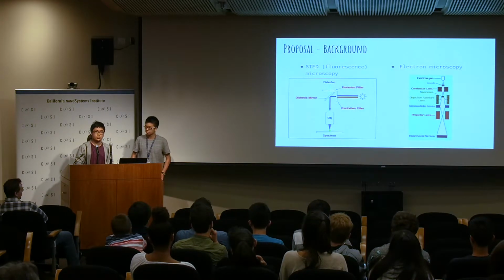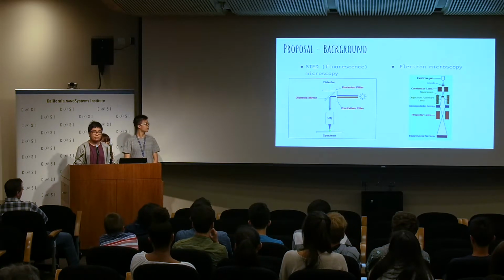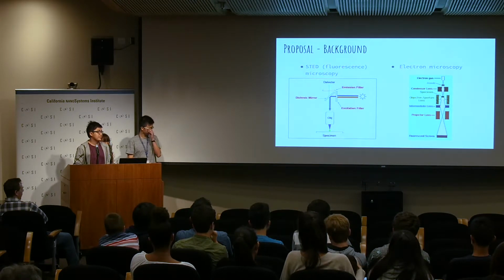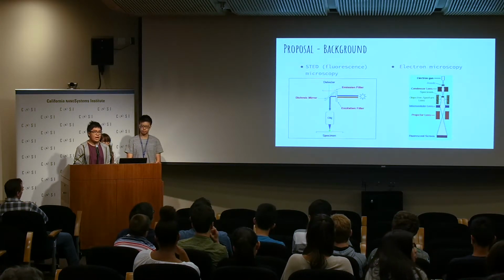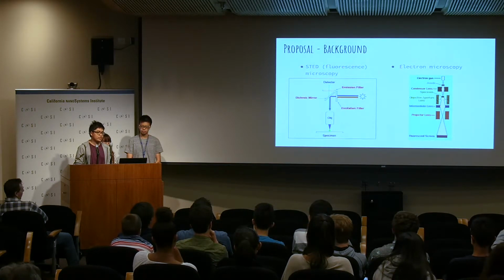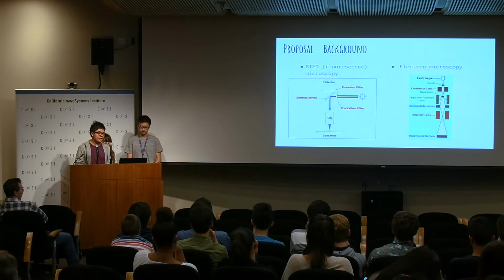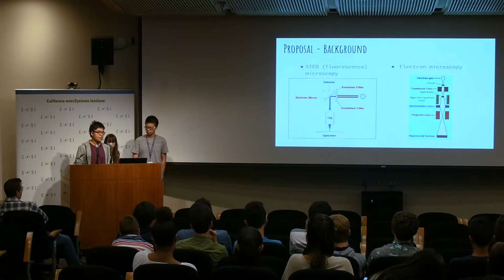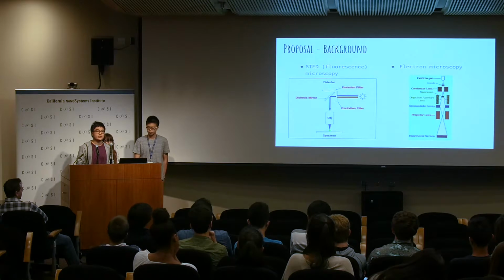So as an overview of the equipment that we're going to use for our research, we have fluorescence optic microscopy on the left. It functions by exciting an electron which emits a photon, a light particle, back into the eyepiece. That's how you see the image. And we have the electron microscope on the right, which features an electron beam shooting through the sample onto the fluorescent screen. And the image that you see is basically an electron density image through the sample. So now Jason's going to elaborate on how we're going to specifically use this equipment to foster our research.